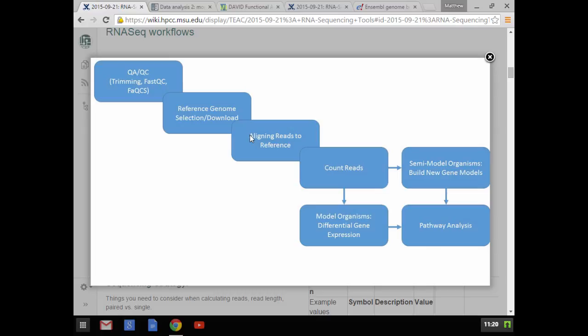It does not care about the length of the gene. It doesn't care about the number of total genes in your sample. When you do your analysis at the end of the day, it's going to care about the total number of reads and how many reads align to any given gene.